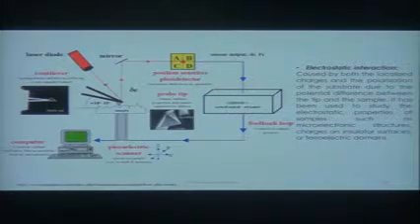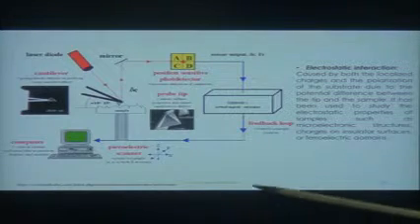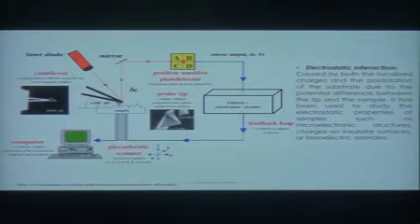Compensation and error checking and so forth, and it's not all that difficult to process the information anymore through the photodetector. You do move your sample, and you need to be able to move your sample at very, very small distances, and that's typically done with piezoelectric displacement devices, right? Because those can move very, very small distances, sub-angstrom potentially.